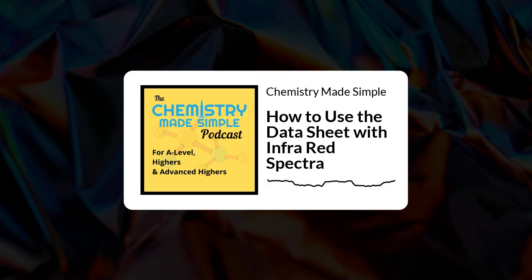Hello and welcome to this week's episode. I hope you're well. Today we're going to talk about infrared spectroscopy. We're going to talk about how the infrared spectrometer works and how the spectroscopy works. We're going to talk about the spectrum that's obtained from analysing a sample. We'll talk about how you will use the infrared spectrum and also mention the fingerprint region, why that's really useful to analytical chemists as well.